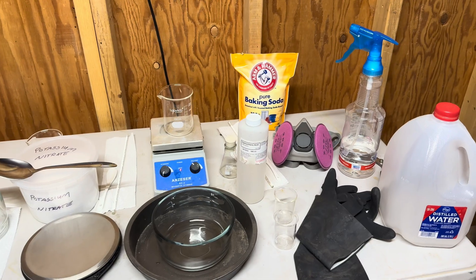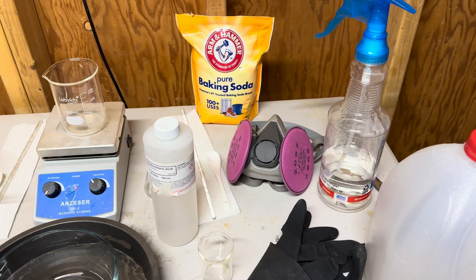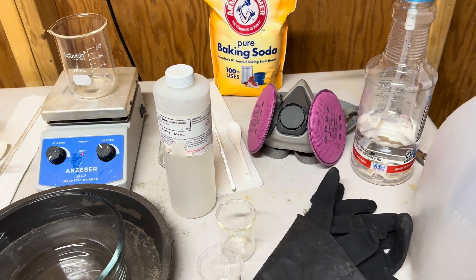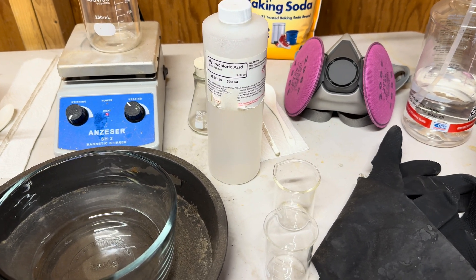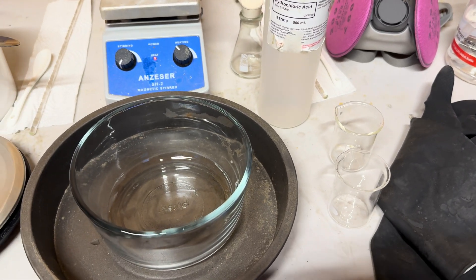You can see that we have a large bag of baking soda. We should always have plenty of baking soda around us for emergencies — baking soda and distilled water will help neutralize most acids should we get any acid on ourselves.